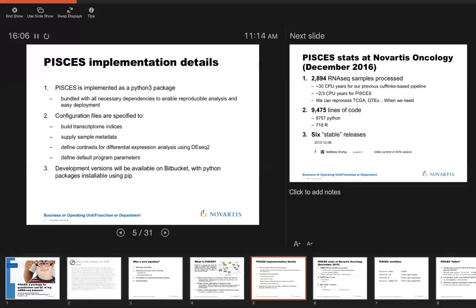Usually it has not been an issue, but if we have funny looking libraries and none of the QC metrics that we track explain that funniness, then we can go back and perform a full alignment and calculate the duplication rate. And most of the libraries are probably made from millions and millions of cells. Exactly, yeah. We're not using this pipeline for single cell sequencing. But there are sometimes kind of intermediate level. Exactly. But something like tracking number of k-mers, like 20 mers, things like that, first 20 mers in reads, that kind of gives you a sense for the complexity of your libraries.